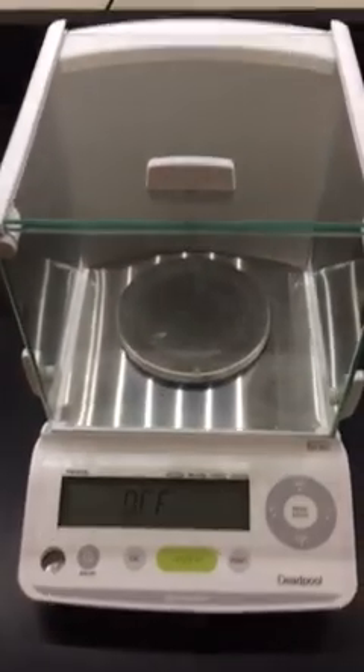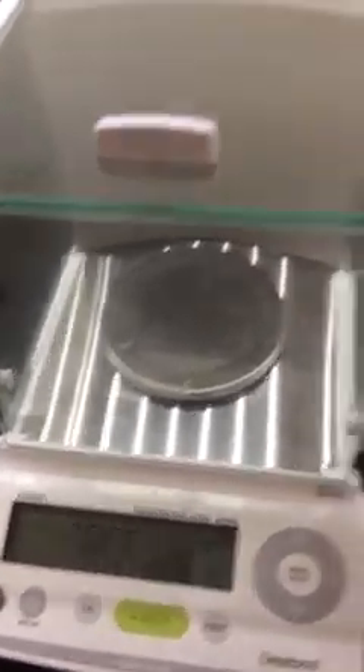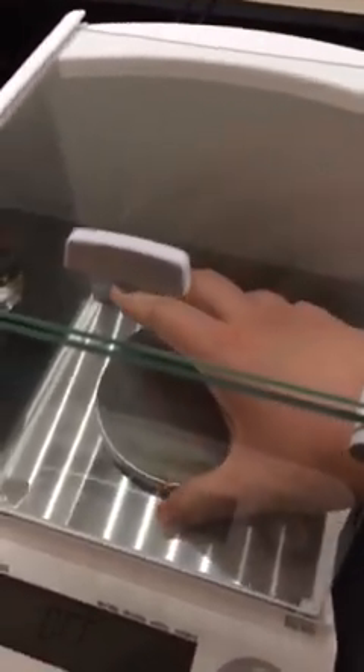Alright guys, I'm going to show you how to clean this really well. Make sure it's off. You're going to open the side and very carefully lift and remove this. As you can see there's tons of stuff under here. Lift this very carefully.